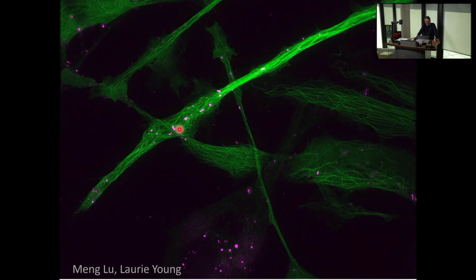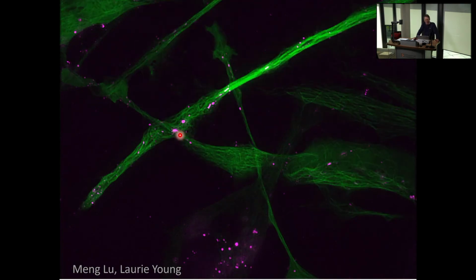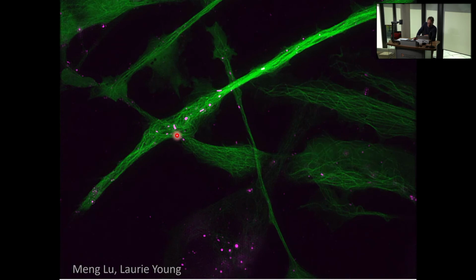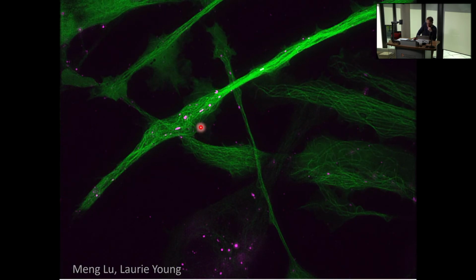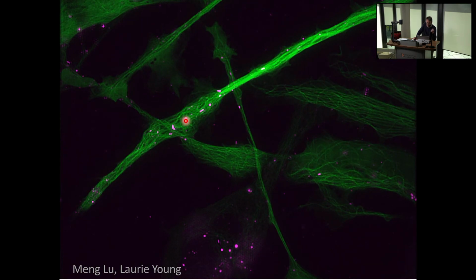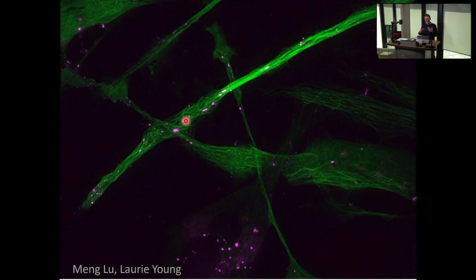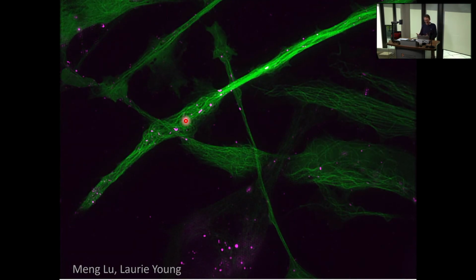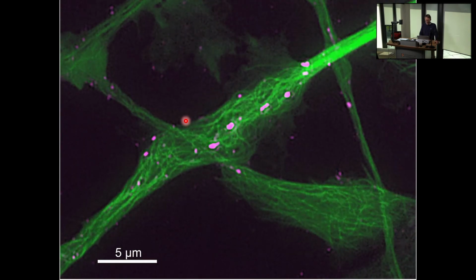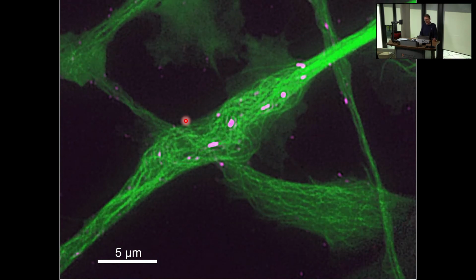So these cells are really working very hard to try and get rid of these foreign invaders that they don't want inside the cells, so they try and deal with it. And of course, if the cell isn't capable of doing that anymore, you get more and more of this aggregation process that accumulates, and then that leads to cell death. And so here you see this again at higher resolution. So again, this is something you just wouldn't be able to see with any other method.